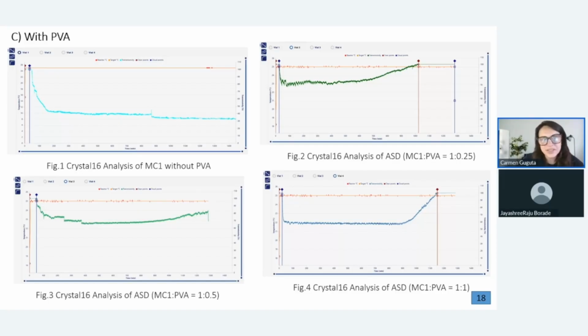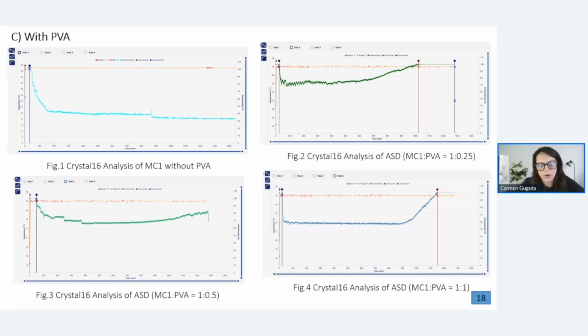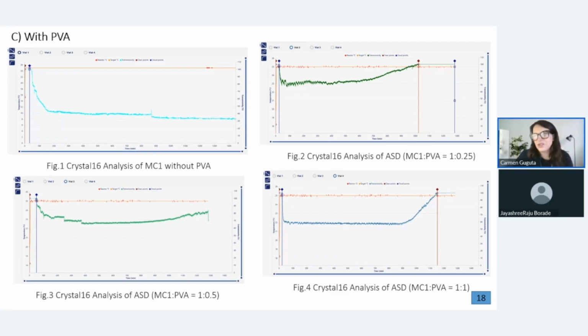What if the material is too fibrous or hard to manage at micro level to weigh in and to dissolve? What would be your advice?